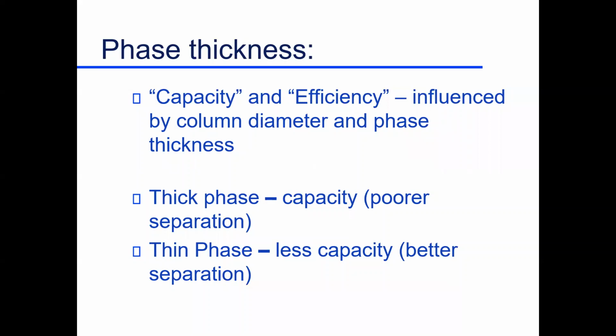So there is a coating inside that column. And so that's what we get our separation, right? Our analytes want to go into that coating, come back out, and so on. Well, how thick should that coating be? I think you can see that the thicker it is, the more likely we are to get some spreading of our analytes. Maybe our analyte just hits the surface of the coating, comes back out and moves out. Another molecule we're interested in goes in further, then comes out. This one's going on its merry way. We're getting the spreading throughout the column.